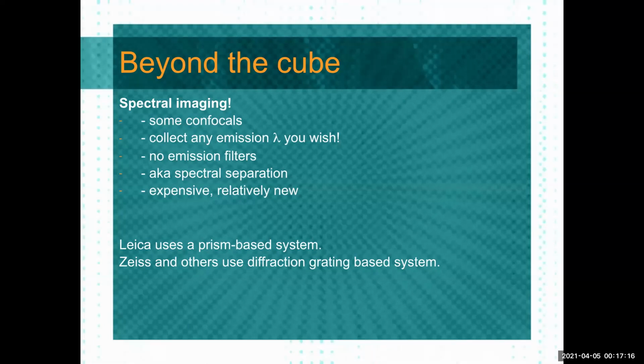Very useful because things like pH will change how a fluorophore fluoresces and what its spectra is. So there's all sorts of info. It's basically acting like a spec, a spectrophotometer, which is a machine used in chemistry and physics mostly.